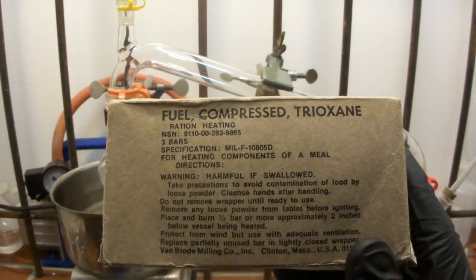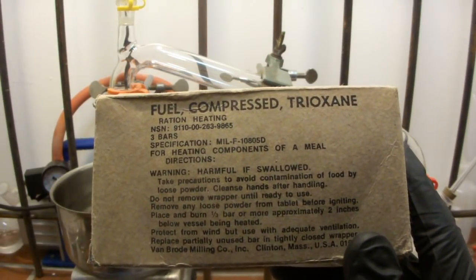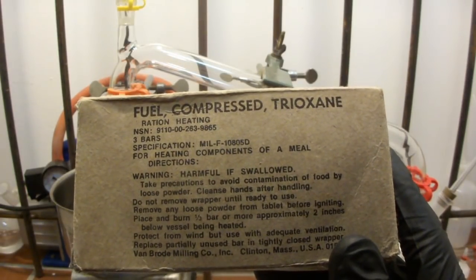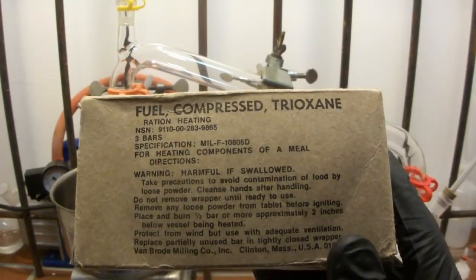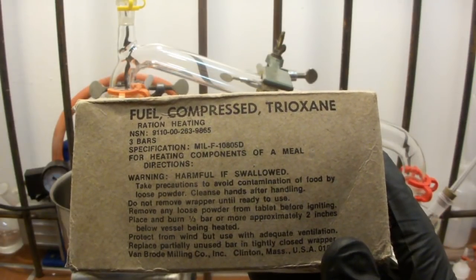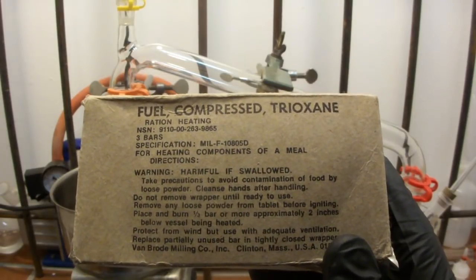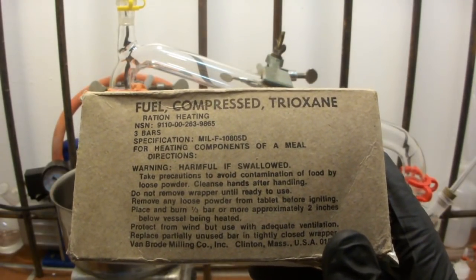These combustible bars made of trioxane are mostly used by the army and also by outdoorsmen. They are very cheap and they usually contain a high amount of trioxane.